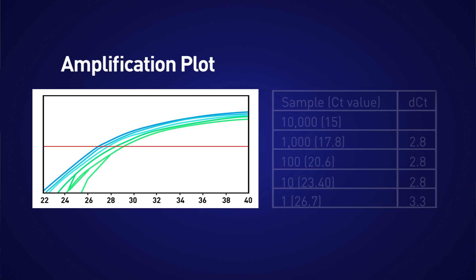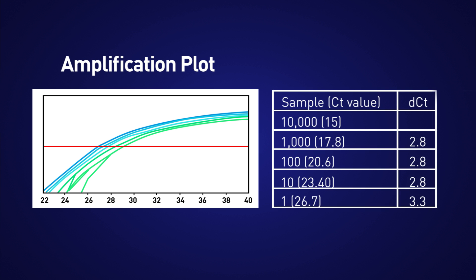Inhibition is worse in more concentrated samples, and so you can often see an improvement in the slope by diluting the sample. This is actually a good way to recognize when inhibitors are the problem. For example, if you made tenfold dilutions of your sample, the delta CT between each point should be about 3.3. When inhibitors are present, we see that the delta CT between our samples is about 2.8, but returns to 3.3 for the most dilute sample point.